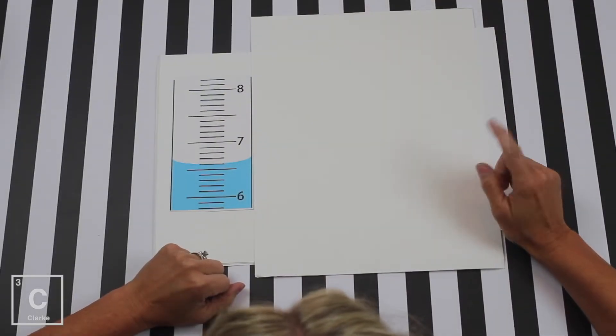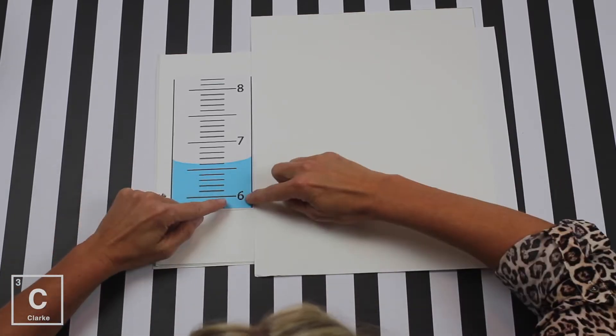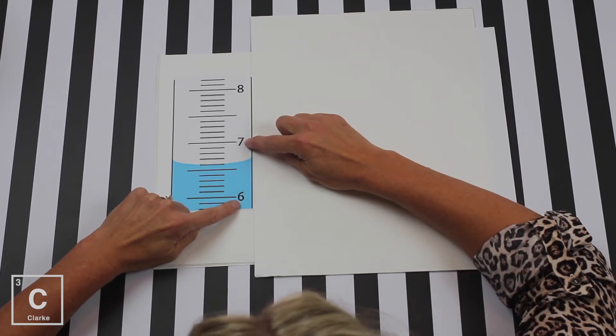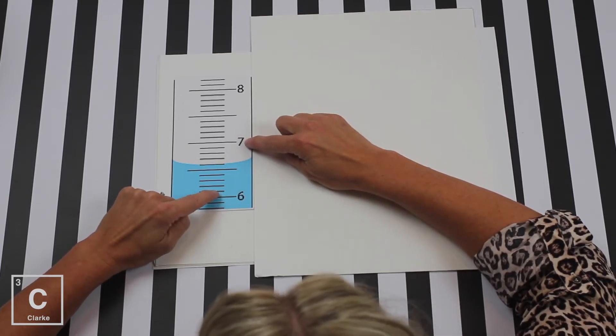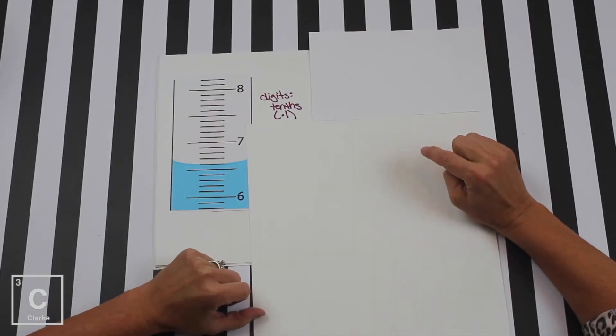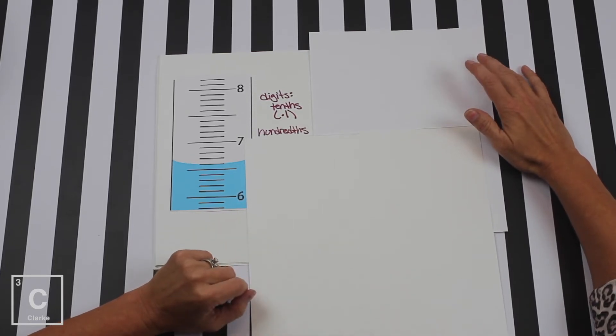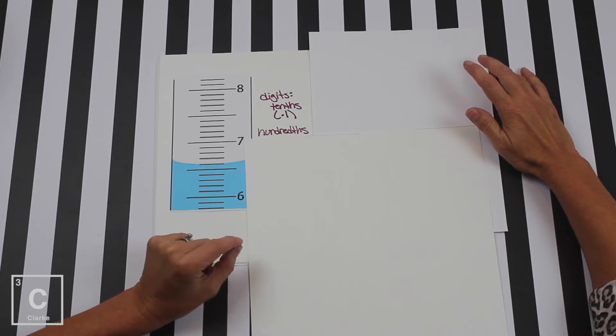So I have a graduated cylinder here. The first thing we need to notice is what are the increments of the little measure lines. If we see we have a 6 and a 7 that's going up by ones, these little lines are going to be 0.1, 0.2, 0.3, 0.4, 0.5. I think you see where I'm going with this. We're measuring in the tenths. All the little lines on this graduated cylinder mean tenths. So if we're going to estimate one digit past the tenths, that's the hundredths. Your answer must have a number in the hundredths place to be considered measuring with sig figs.